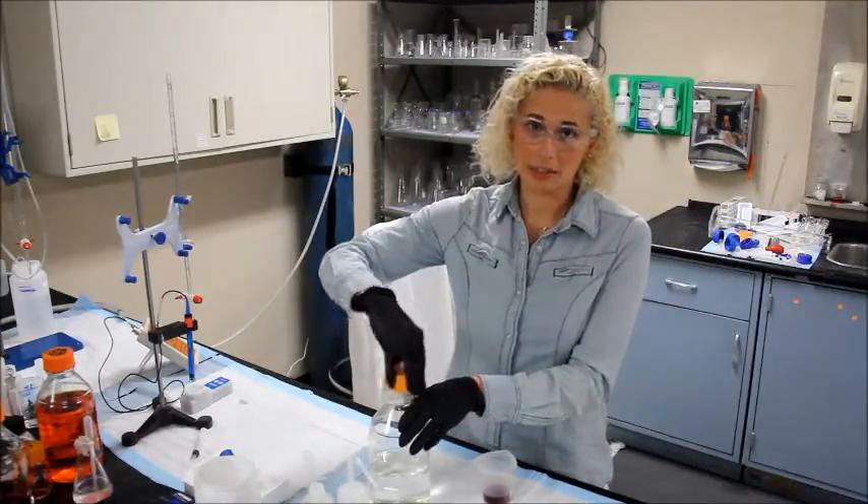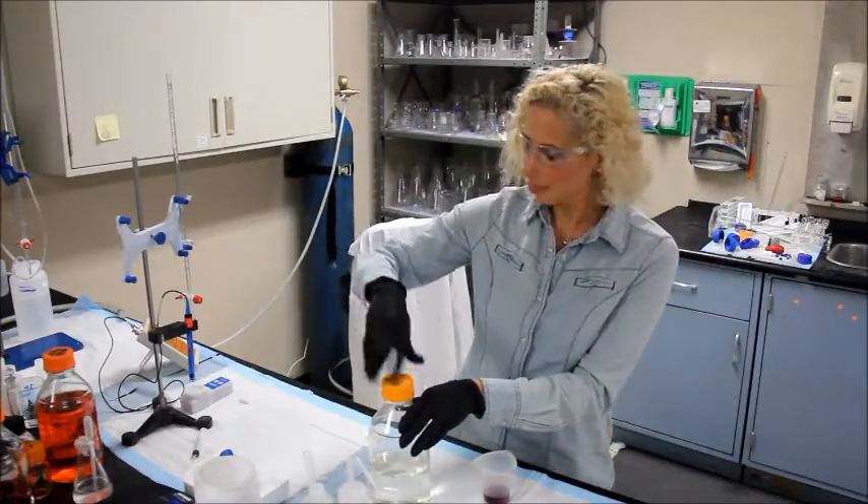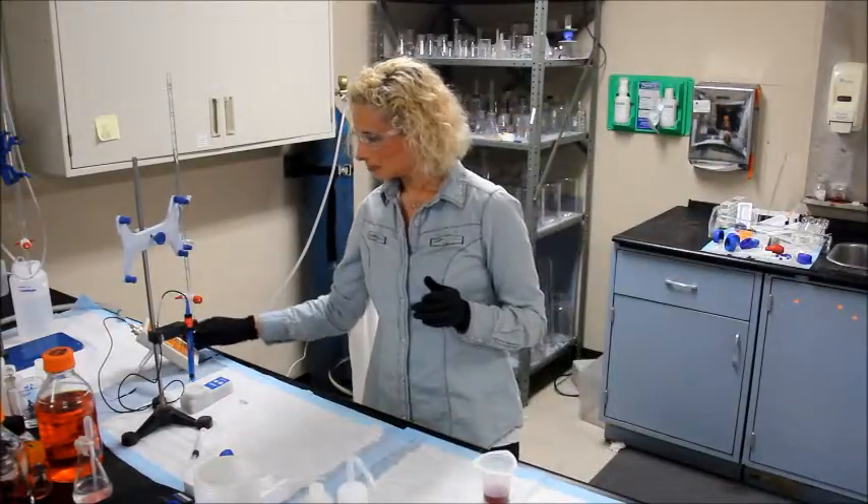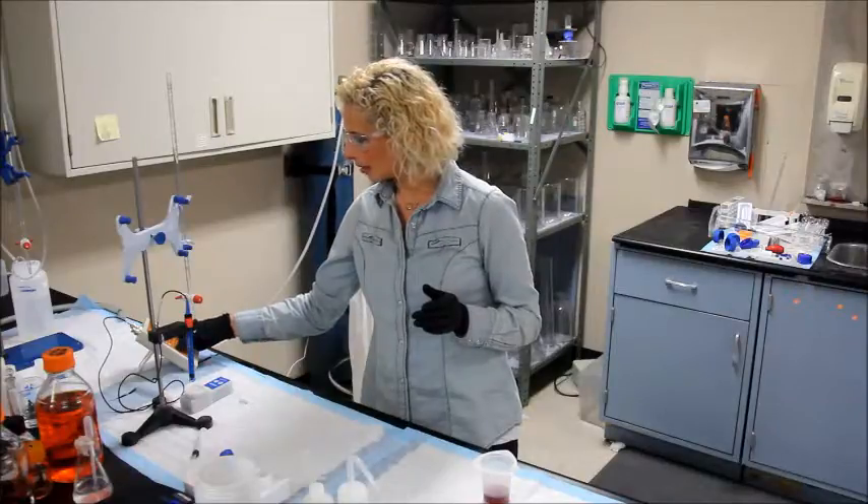Add 10 ml of D.I. water. I am now going to perform a standard TA titration. Turn your instrument on if it isn't already, and put it in TA mode.